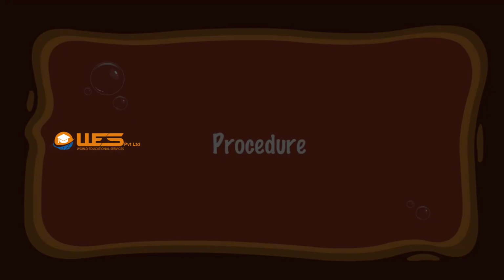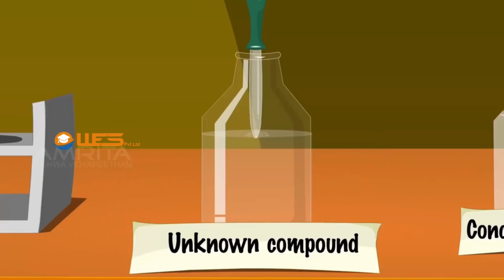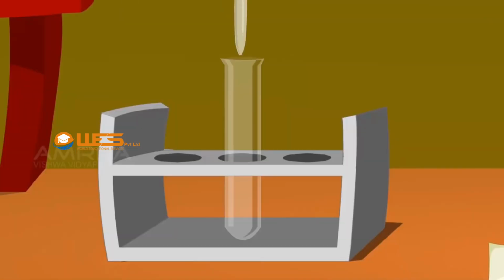Ester test. Procedure. Take a dropper. Take a few drops of unknown solution. Add it into the test tube.